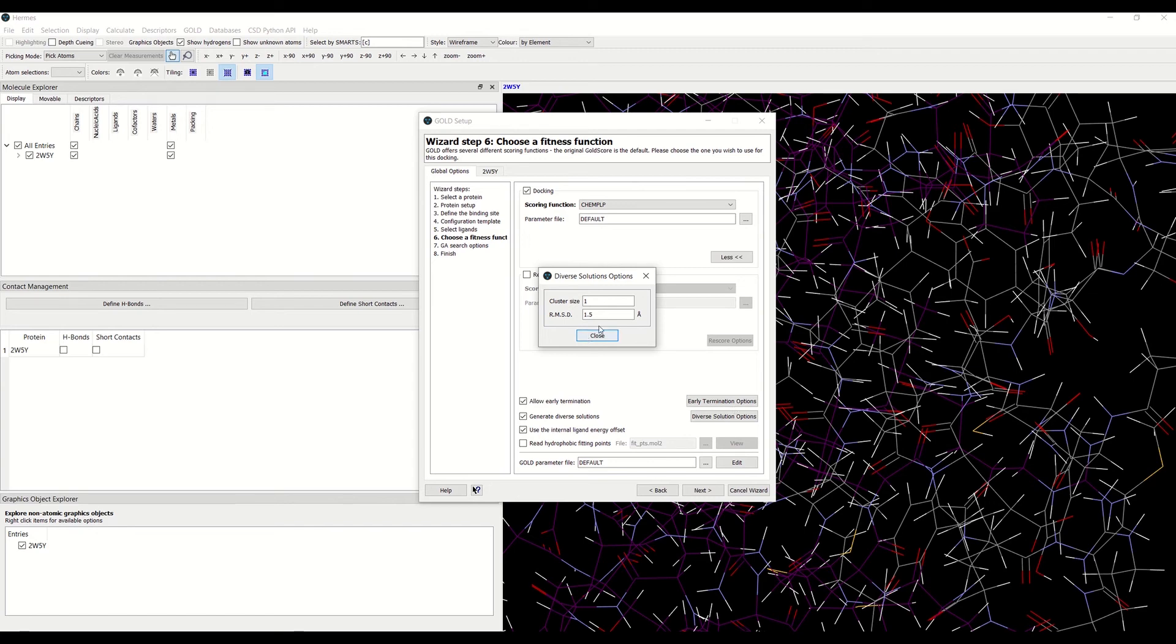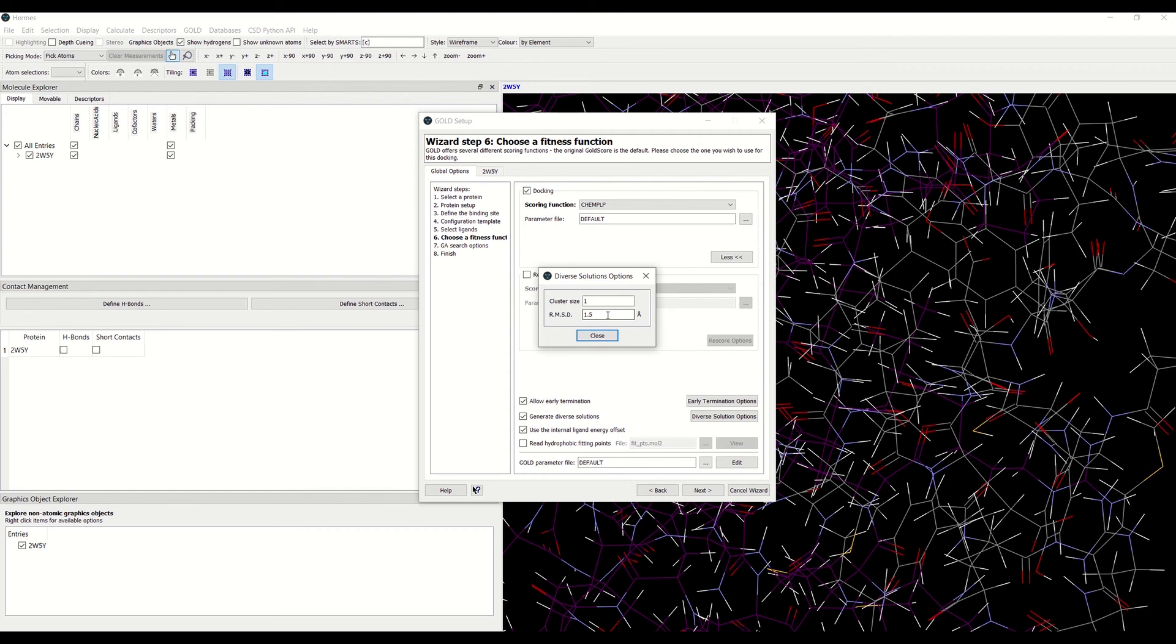Then you can specify the RMSD. The default here is 1.5 angstroms. You can use this setting to define the heavy atom RMSD cutoff for determining if diverse solutions are in the same cluster or not.